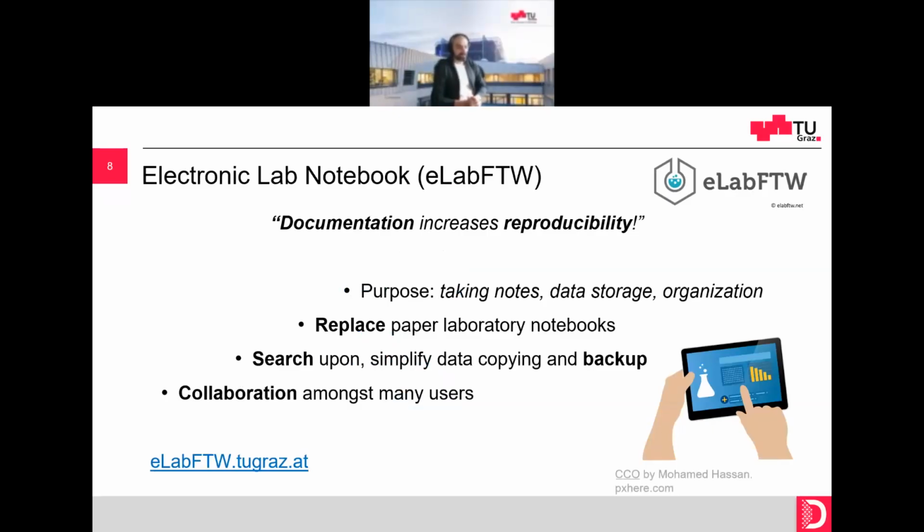The main idea behind eLabFTW is that our documentation increases reproducibility and also gives us a better insight into our data, for us and for others as well. The main purpose of it is, of course, taking notes, and this is equal to generating metadata, but also, to a certain extent, storing data and metadata, and also having some kind of basic organization, or lab organization, for our group or institute, for example. It is also intended to be a replacement of paper reports and notebooks, because they have some disadvantages, but of course advantages as well.